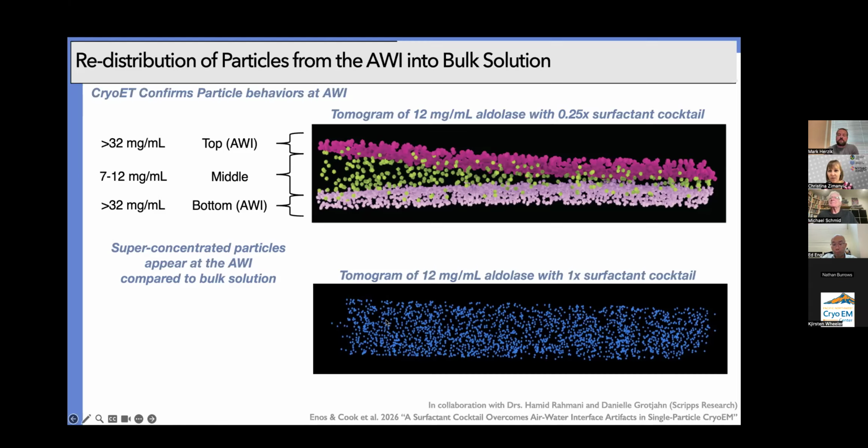And so we are exploring doing dropouts where we add one of those in replacement of other ones that have slightly similar chemical properties. What we're hoping for is this current formulation is not going to work for every sample, but across the different formulations and with community feedback, we can get something that does work.